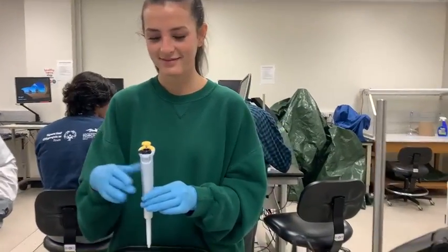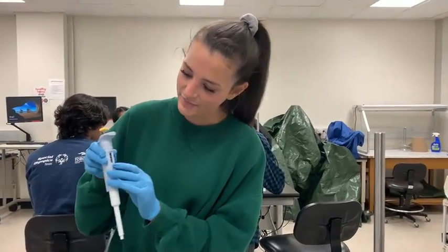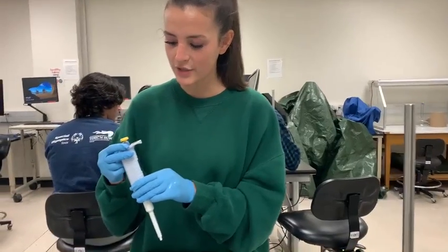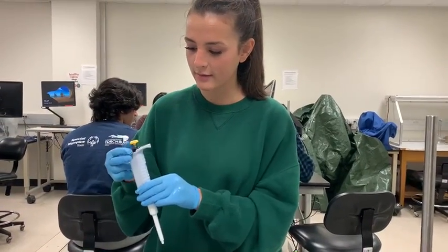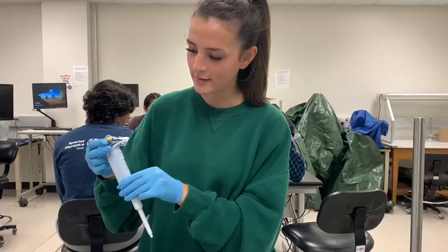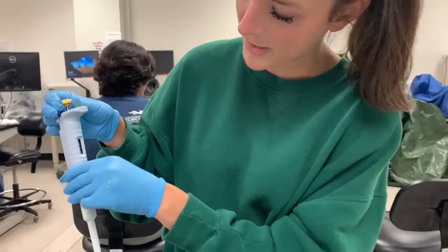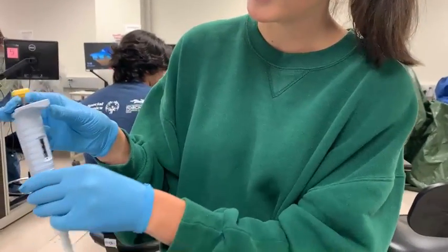Victoriana, which one do you have here? I have the 50, or the 20 to 200. I'm going to first unlock it, and then set it to 50 — it's actually already set to 50. So I'm going to go back there and then lock it again.